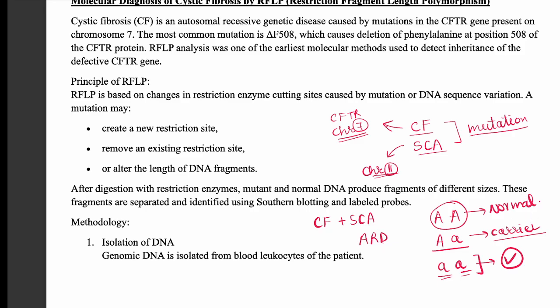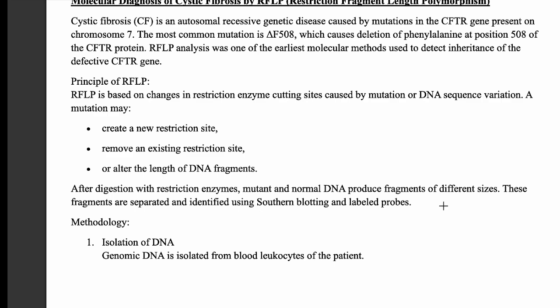So the first technique which we are going to study today is restriction fragment length polymorphism. Let me explain the core idea of restriction fragment length polymorphism. So basically, what does RFLP analysis do?